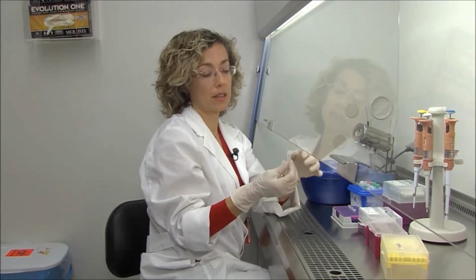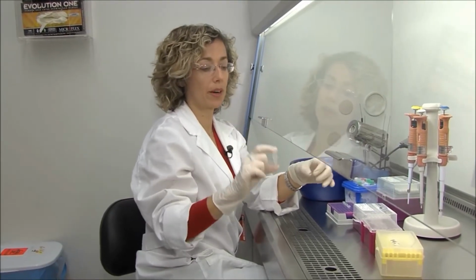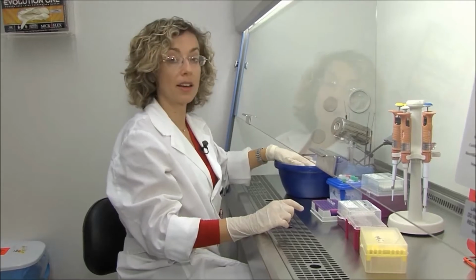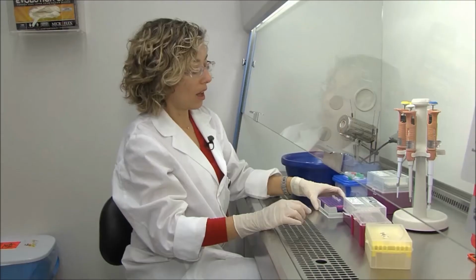Prepare my master mix using a 1.5 ml tube. This really depends on how many samples you're going to prepare. But it is important that all your reagents all the time are on ice. So including the tube that you're going to use to prepare your master mix.